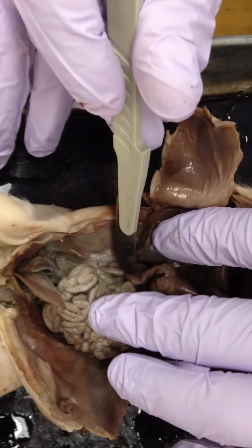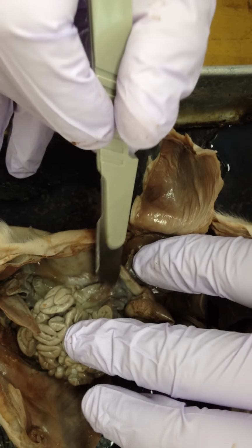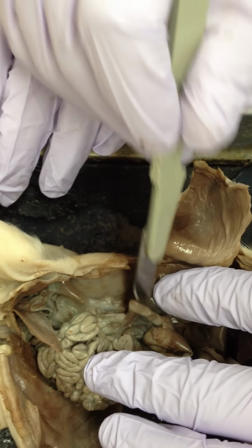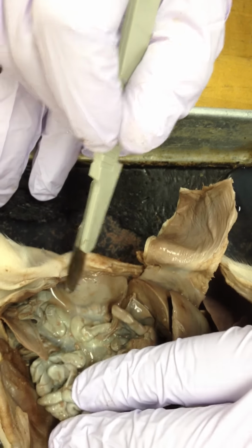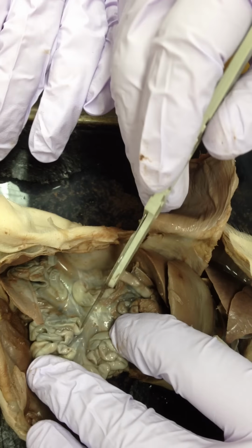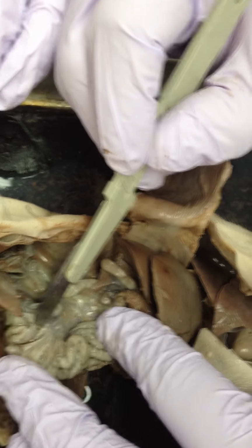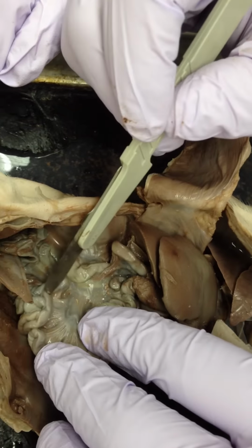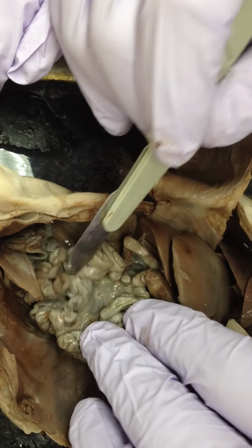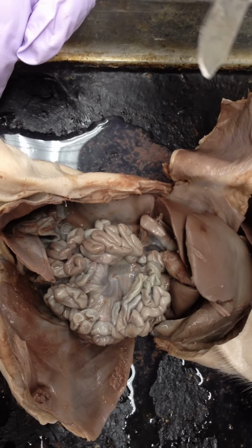This layer that keeps the small intestine tethered to the body are the mesenteries, which are double serous membranes. If you really grab the small intestines, you see those stringy things there? That's all the mesenteries. And look at how they just wrap it like a little tree. So make sure that you show those as well.